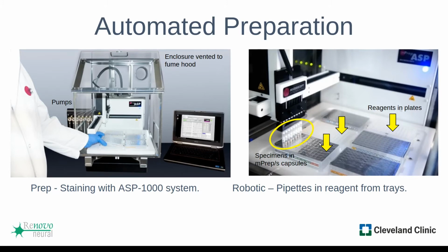Reagents are loaded into the 96 well plates, or optional trough well plates, or other plates depending on the user's usage of the system. So the plates can be covered and sealed with an aluminum sheet or a plastic sheet, or unsealed if it's not something that's going to evaporate quickly. Six plates can snap into the base of the system, and from the computer is where the operator creates or alters the protocol, and then that can be saved and repeatedly used each time, and other users can run the protocol, which reduces variability between people, and it just makes sure that everyone's using the same protocol.